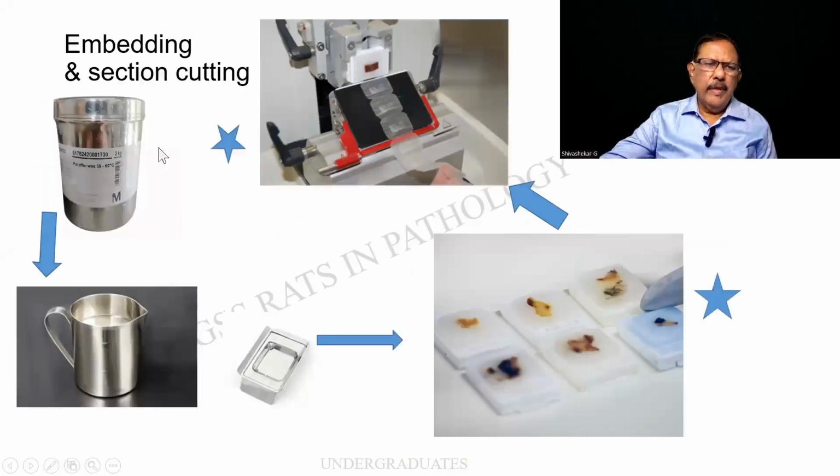And this is our friend, the paraffin wax. I told you in the tissue processing itself, it is becoming molten and it can be used for processing, or after you people finish the impregnation, I take the tissue out, I again repour it so that I produce what is called wax blocks. So the tissue that you had sent me is like this, or what I had sampled is in the form of wax blocks or paraffin blocks.